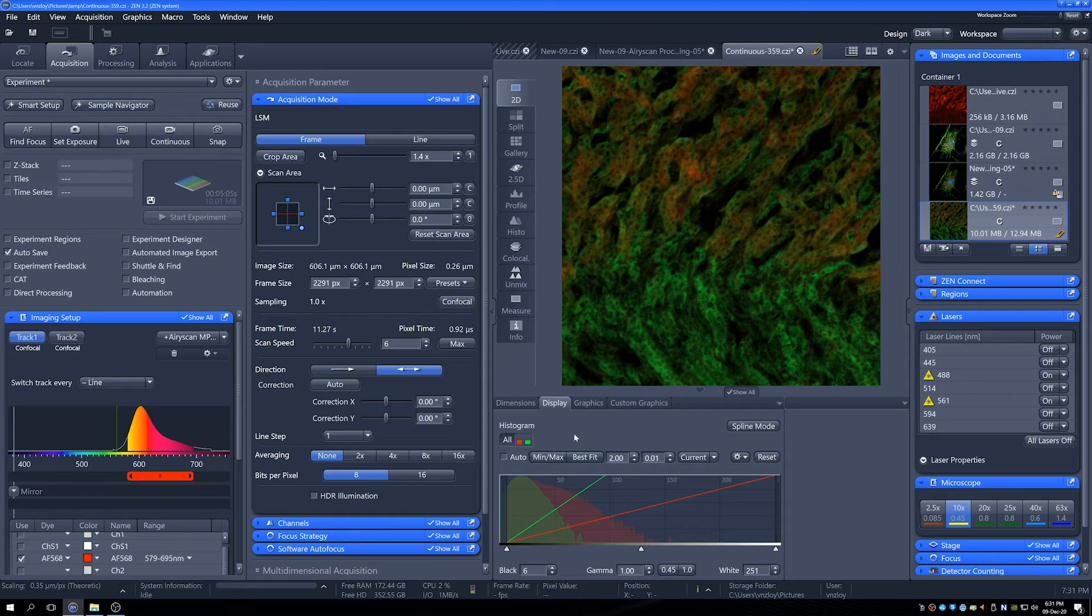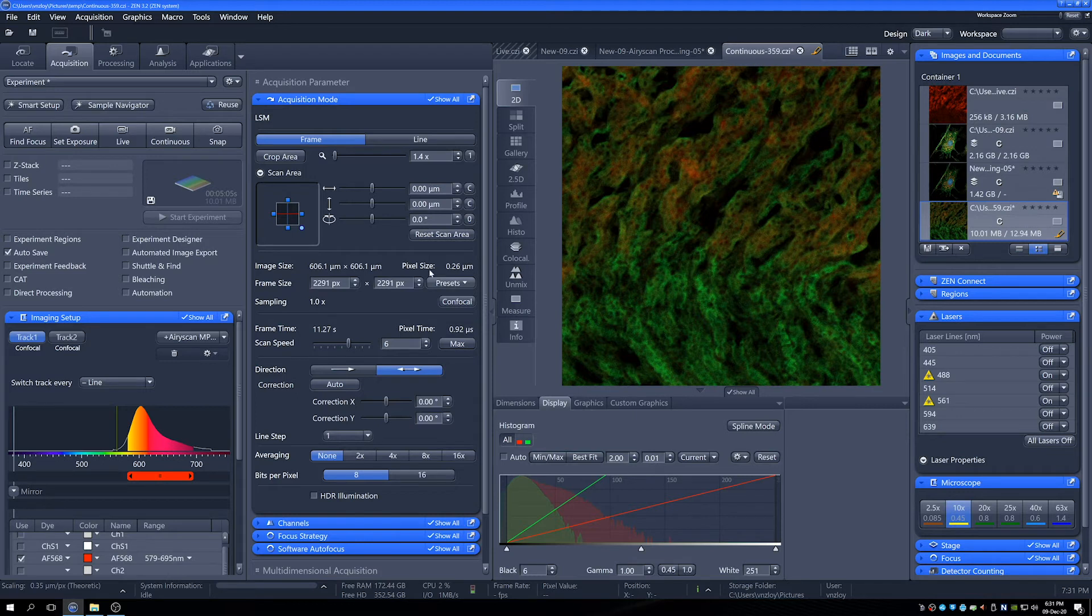Ideally, if we were going to take these images, then we'd want to fill our histograms in this kind of mode. But for now, while we're just having a little look, this is fine.